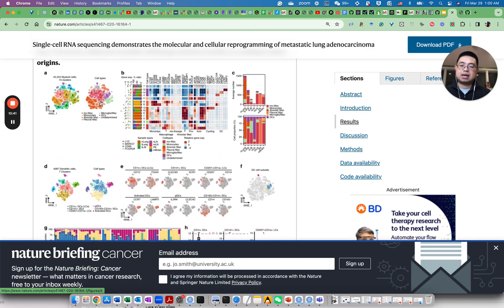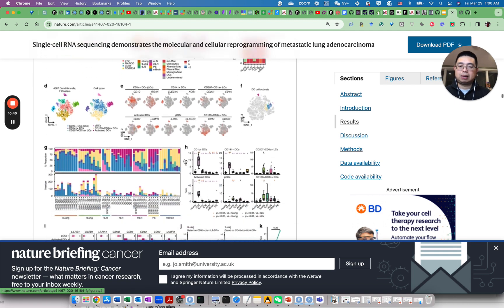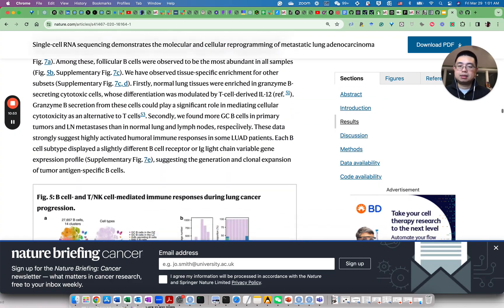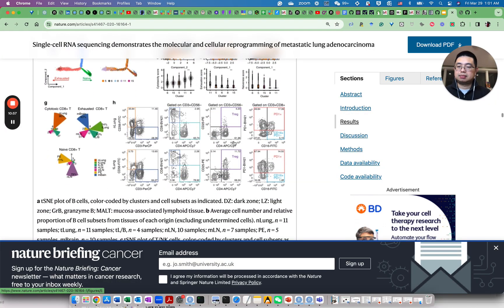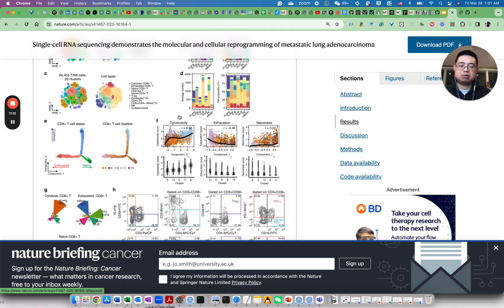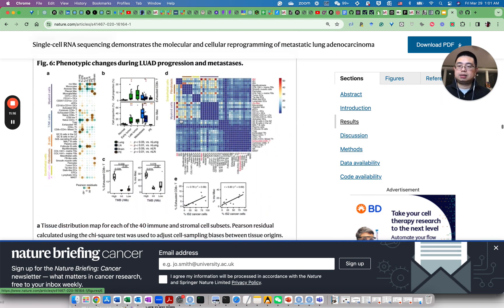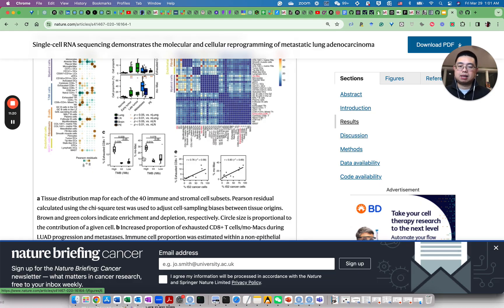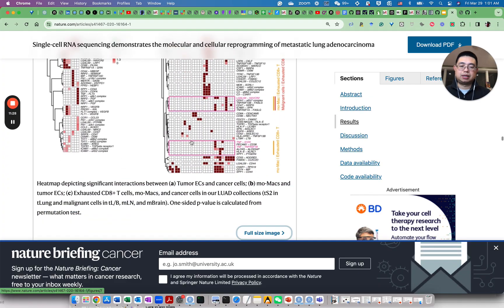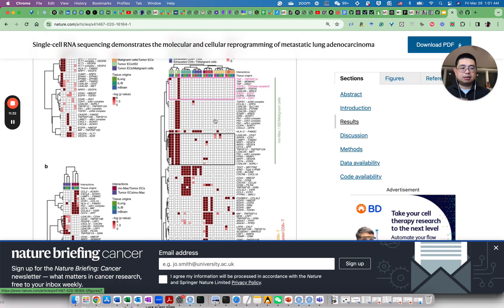In figure four: scatter plots, heatmaps, stacked bar plots, and box plots. There's also a spider plot which we haven't covered in the slides, but you can make it in ggplot2 too. The rest of the figures are all very common types covered: heatmaps, scatter plots, and box plots. The last figure is essentially pure heatmap. Make sure you learn how to use ComplexHeatmap so you can make any heatmap you want.